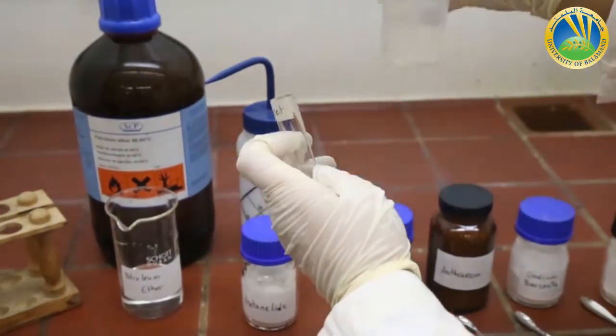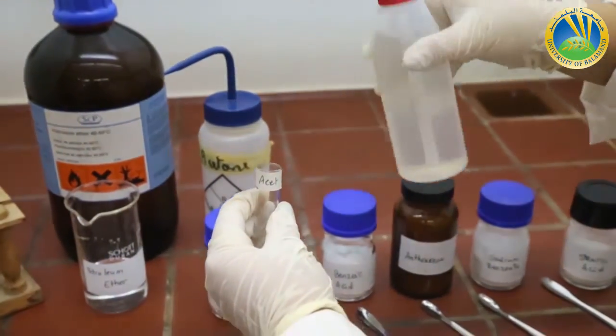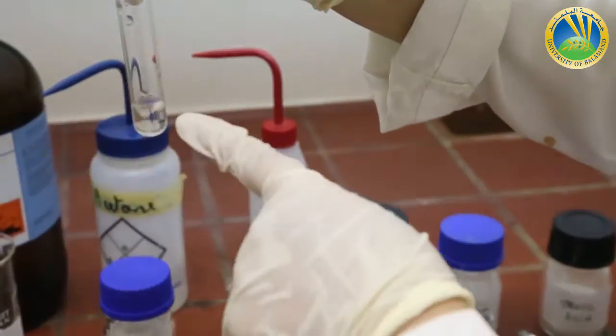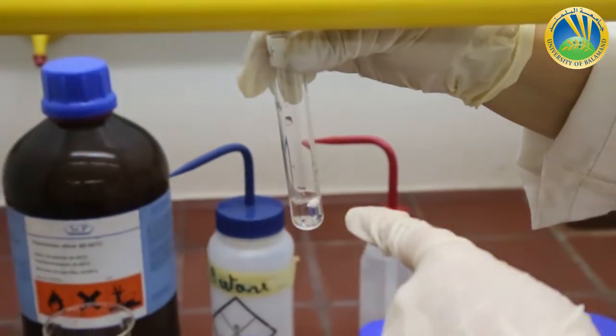I will start to test the solubility of the 5 compounds inside water. So this is a small amount of my product with a small amount of my solvent.